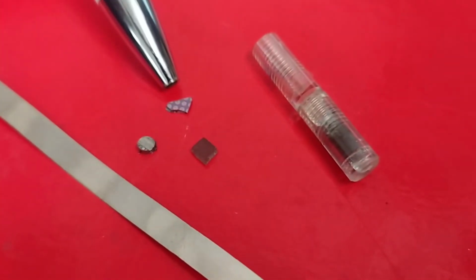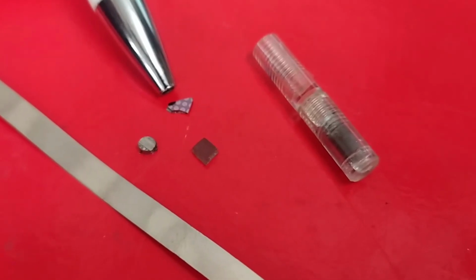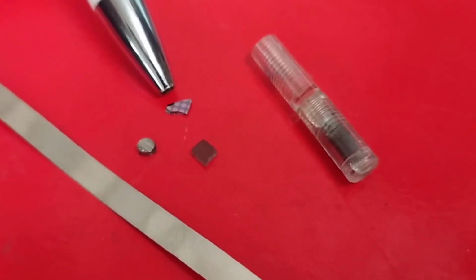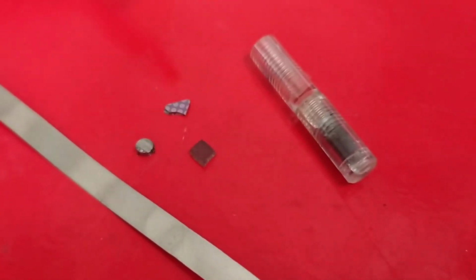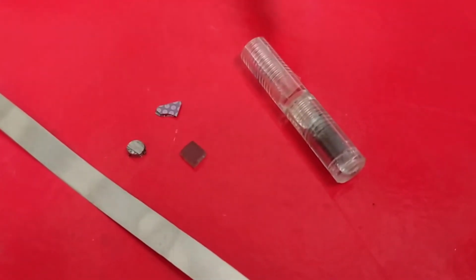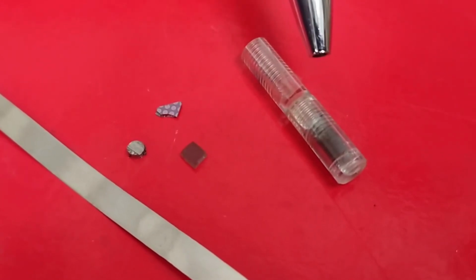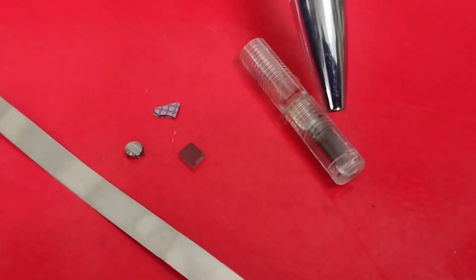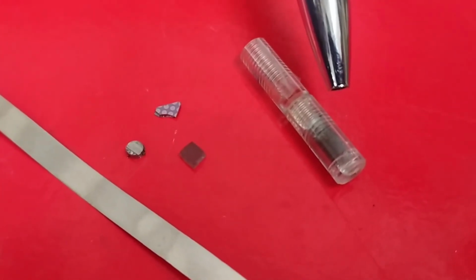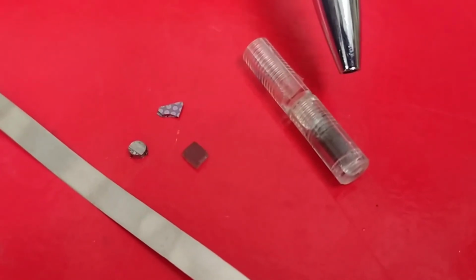Another typical example is a thin film, so a substrate with a magnetic coating of some kind. In this case, the thin film is even patterned, so there are microstructures designed on top of it. Another example is made of nanoparticles. This sample holder is similar to one of those that we have seen before, but this is empty, and inside you can put a known quantity of nanoparticles in order to measure their magnetization.